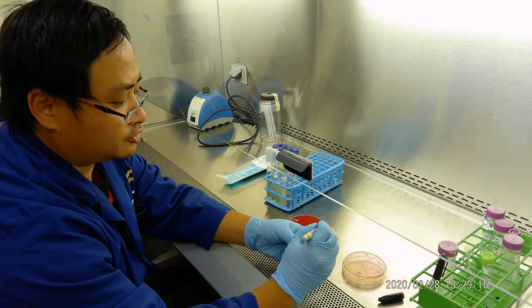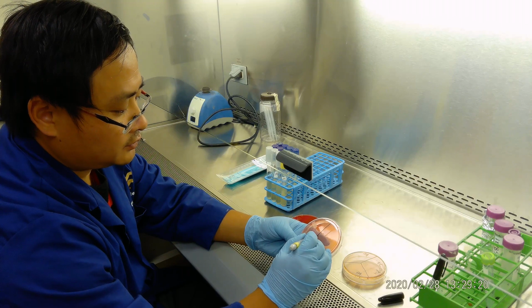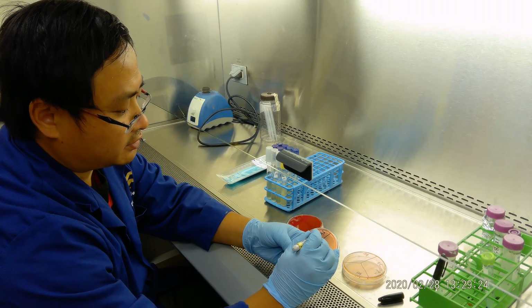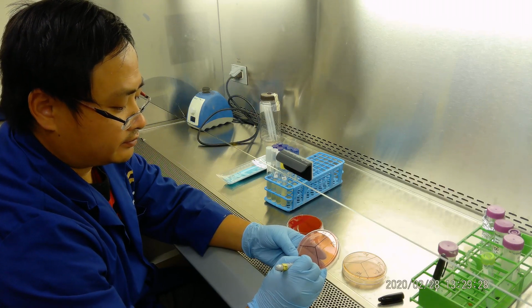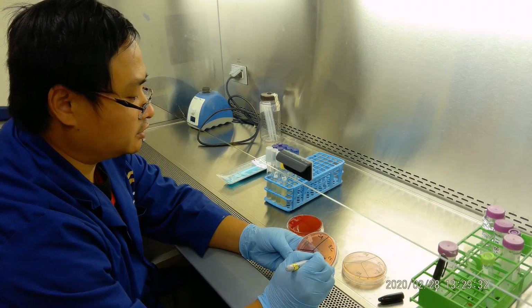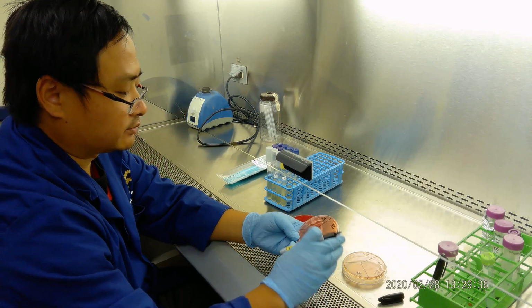Second one, for mannitol salt agar, we also do the same thing. So Lee, also take a picture for this. So we have Staphylococcus aureus, E. coli, and Pseudomonas aeruginosa. So we write the initials, date, and the bench number.